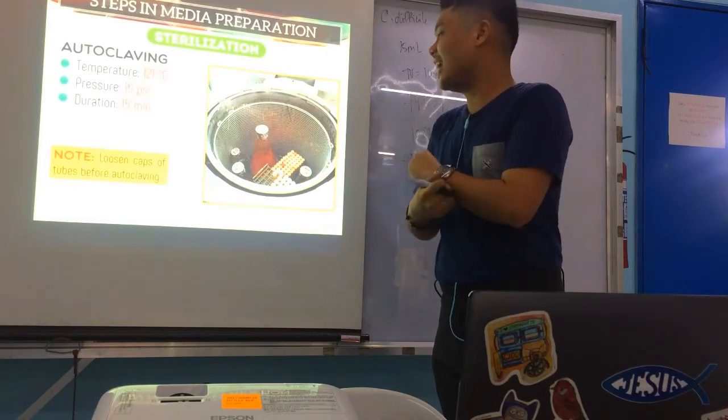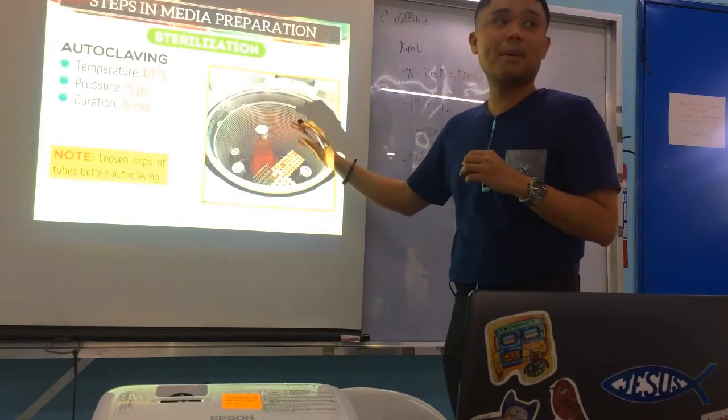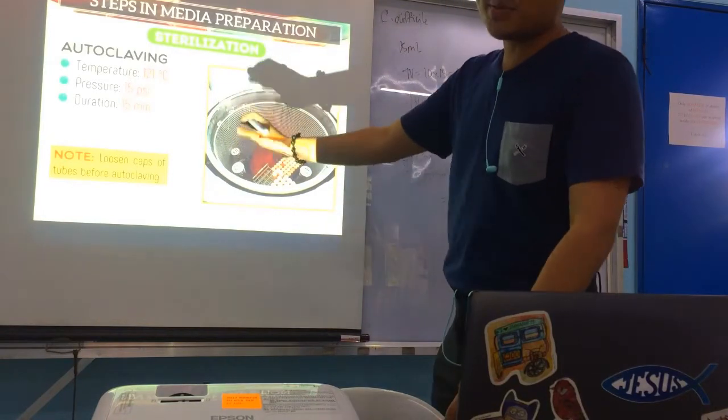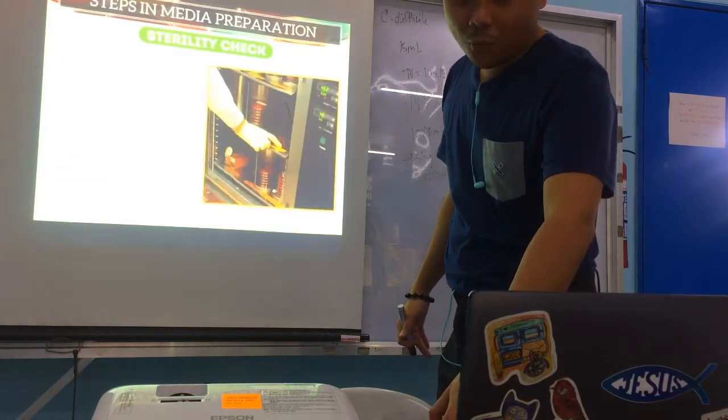Okay, anyway. So again, it should be well packed, loosely packed, so that the steam can penetrate well. And loosen the caps for autoclaving so the pressure can release. Alright, next is the sterility check.